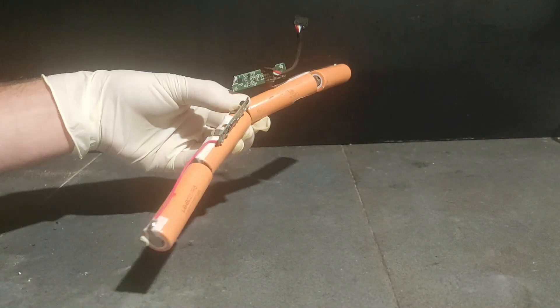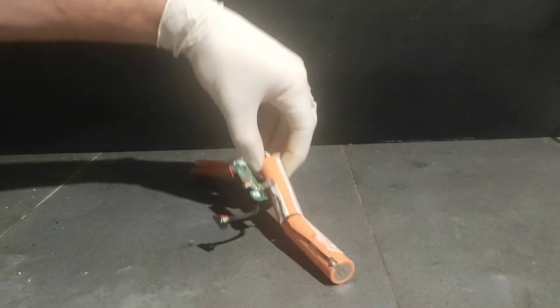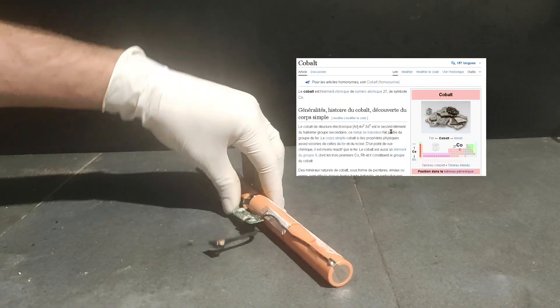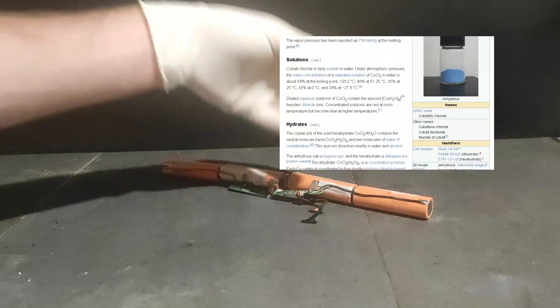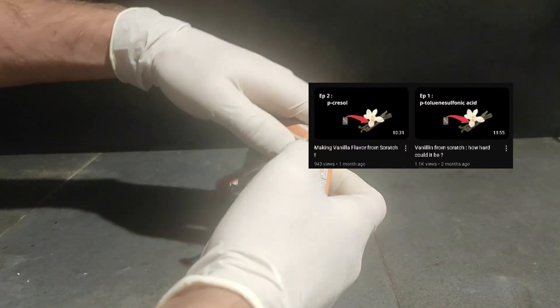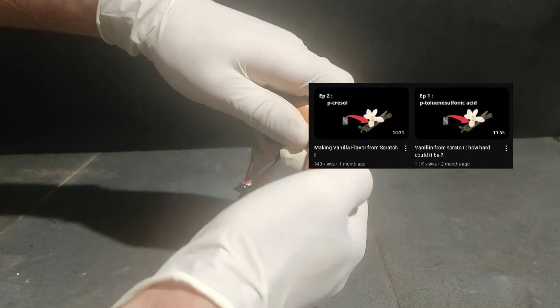This is a pack of lithium batteries that I took off a Nord laptop. It doesn't look like much, but from them you can actually extract quite a few chemicals. The one I'm after today is called cobalt, and we're gonna extract it in the form of its salt, which is called cobalt chloride. I need it for another project, which is making vanillin from scratch, but that's not the topic of this video.